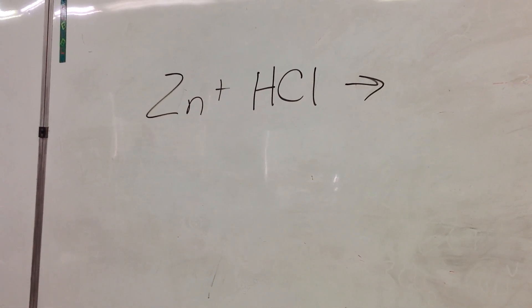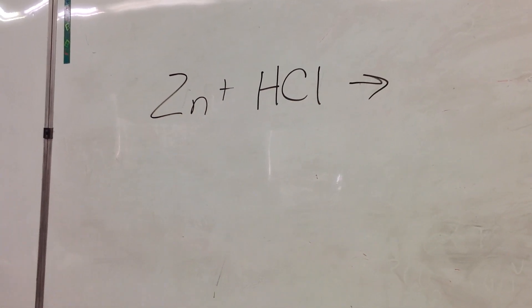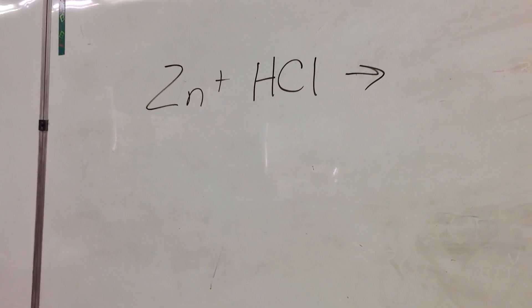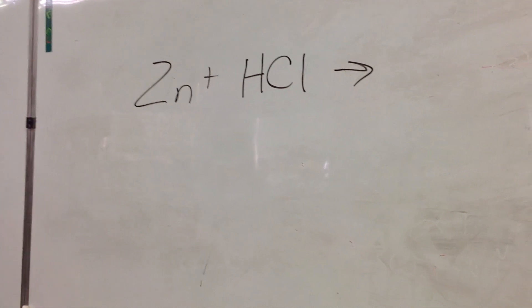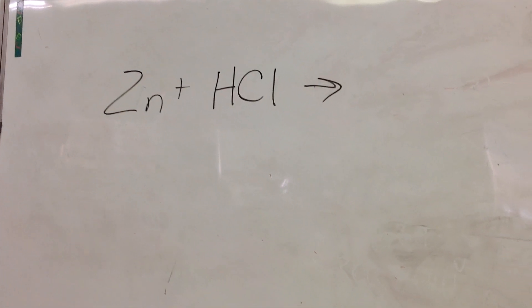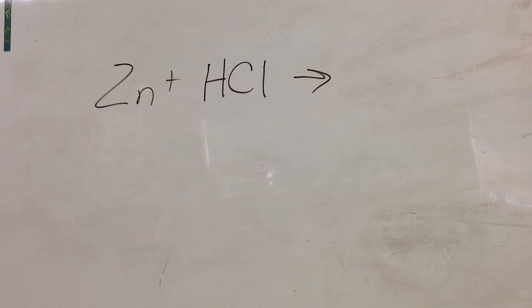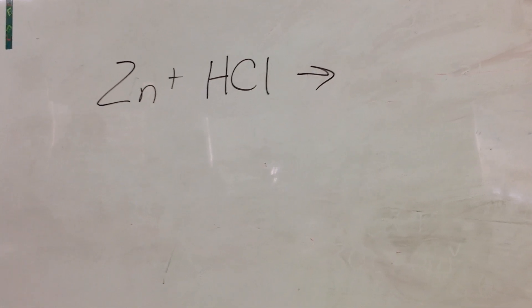Alright guys, today's demonstration is a single replacement reaction. We are going to be putting zinc metal in hydrochloric acid. As you can see, we do not have any products listed yet. We know what they are - do you want to go ahead and try to guess them?